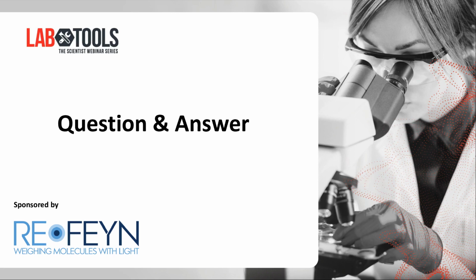Great, thank you. So some proteins make higher order oligomers at higher concentrations, and it seems that using high concentrations of protein in this technique could lead to a crowding effect. Is that so? Can you speak to that?